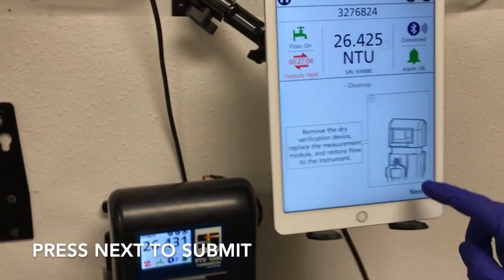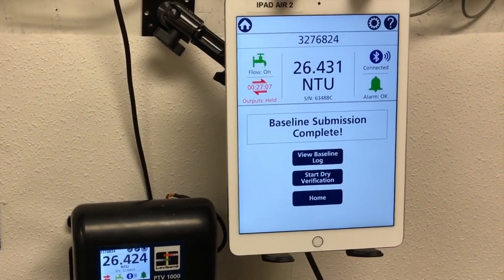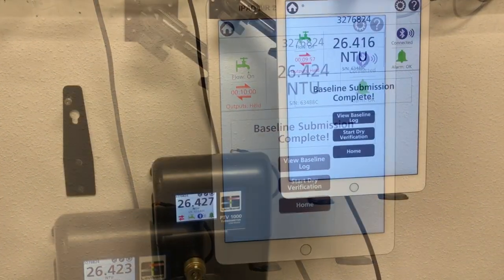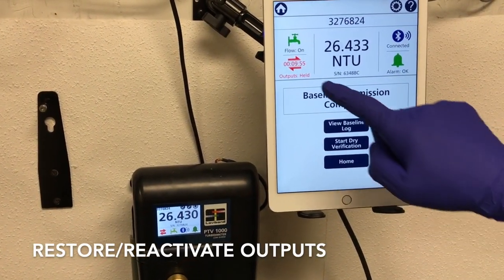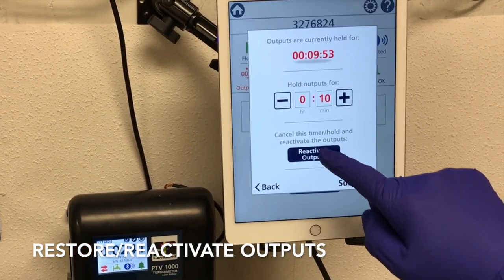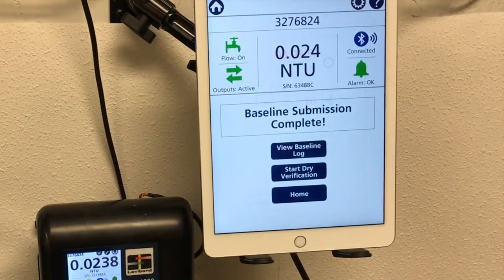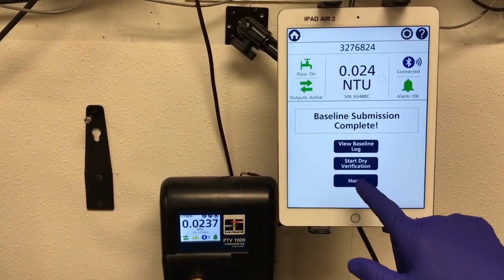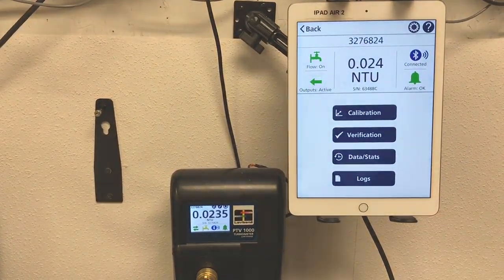Pressing Next will submit this new baseline. Once the baseline has been submitted, outputs need to be reactivated. Press Home within the app to go back to the main menu.